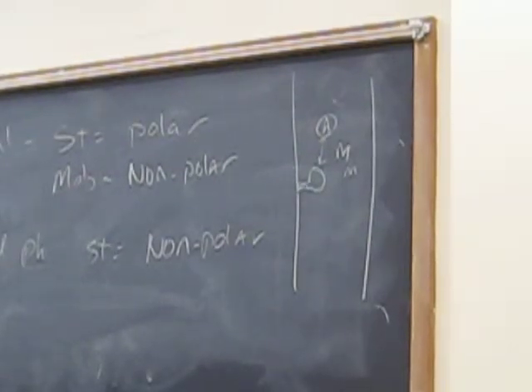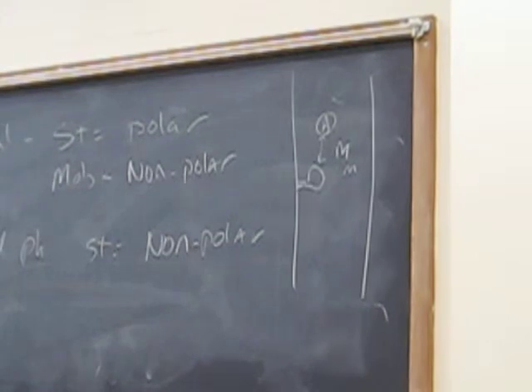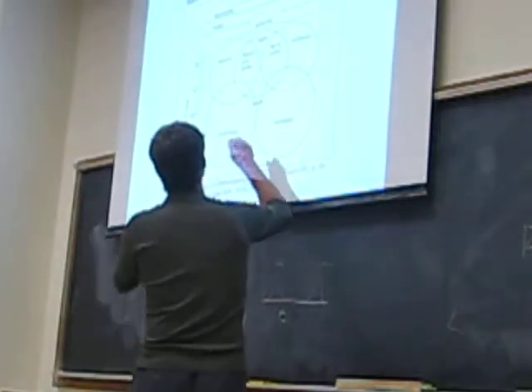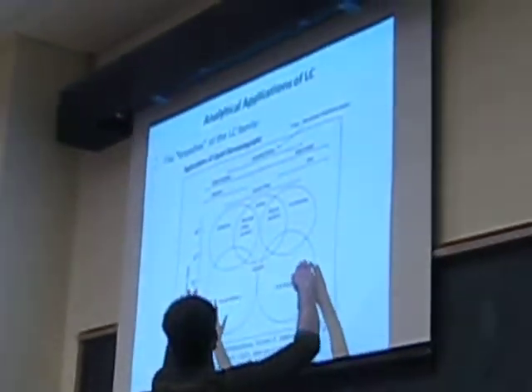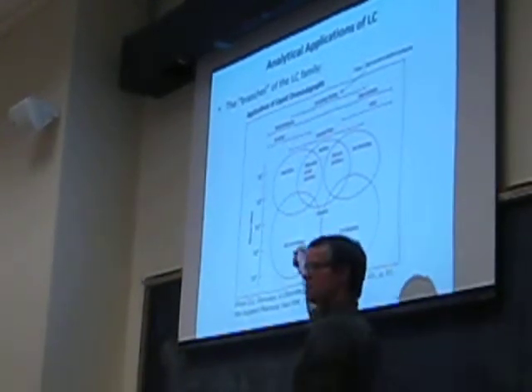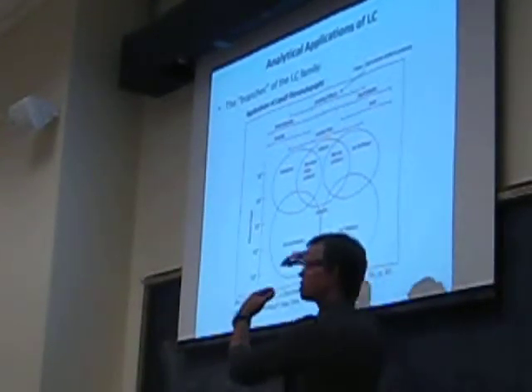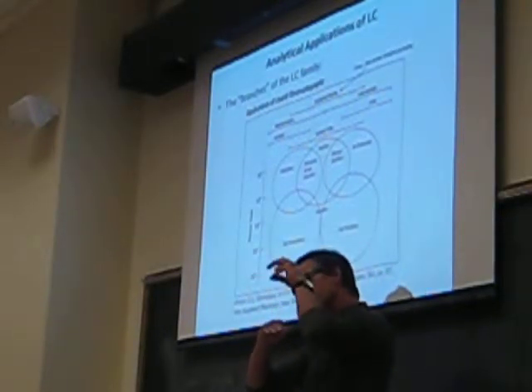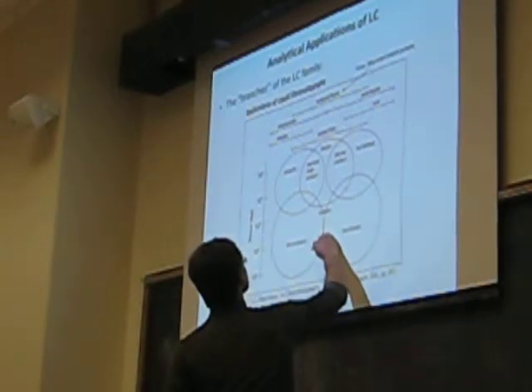So you can look at a scheme like this and say, all right, let's kind of put it all together. I have here the exclusion kinds of chromatography where gel permeation and gel filtration are very similar. Right? And these are separating things based on excluding things going into a space based on their size. So these are exclusion kinds of separation schemes versus partitioning.